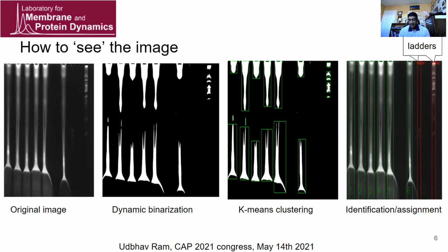The last step is to identify and then assign these ladder values and these column values, essentially, all across the image in terms of our columns of interest, as well as our ladders.